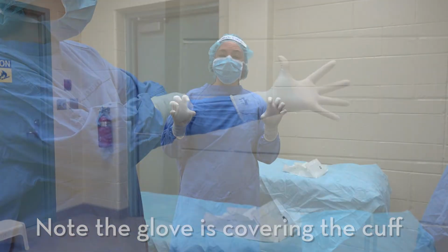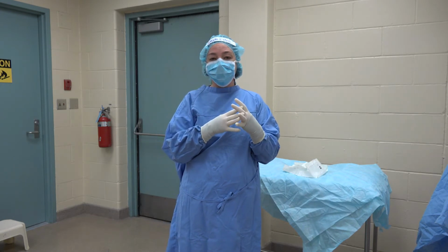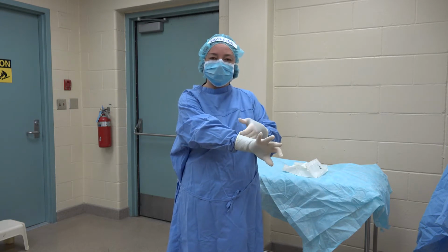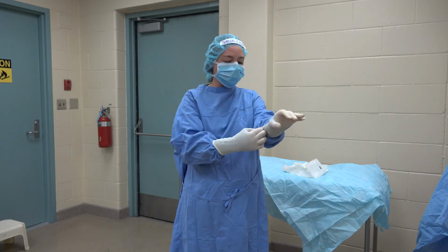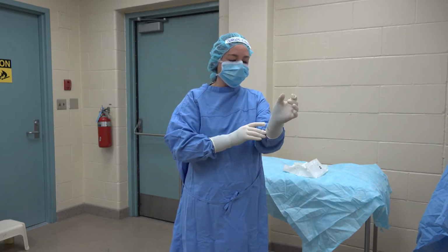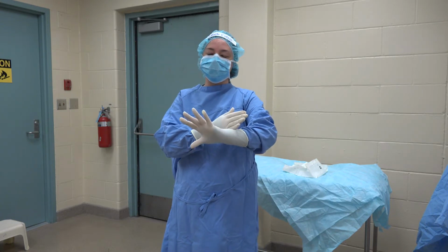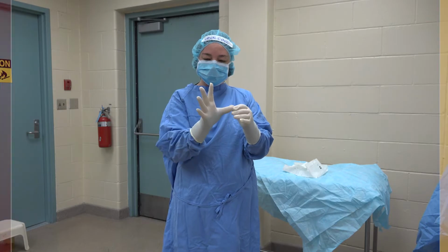Now, if you don't dry your hands well enough, it's going to be sticky, it's going to be super hard, it's going to be very, very difficult. You can fix all of these things once you get started. So I can fix this glove if it rolled up a little bit. I can unroll it. If you leave it super rolled up next to here, it's going to cut off your circulation. Your hands are going to go to sleep. So try to smooth it out as much as possible.